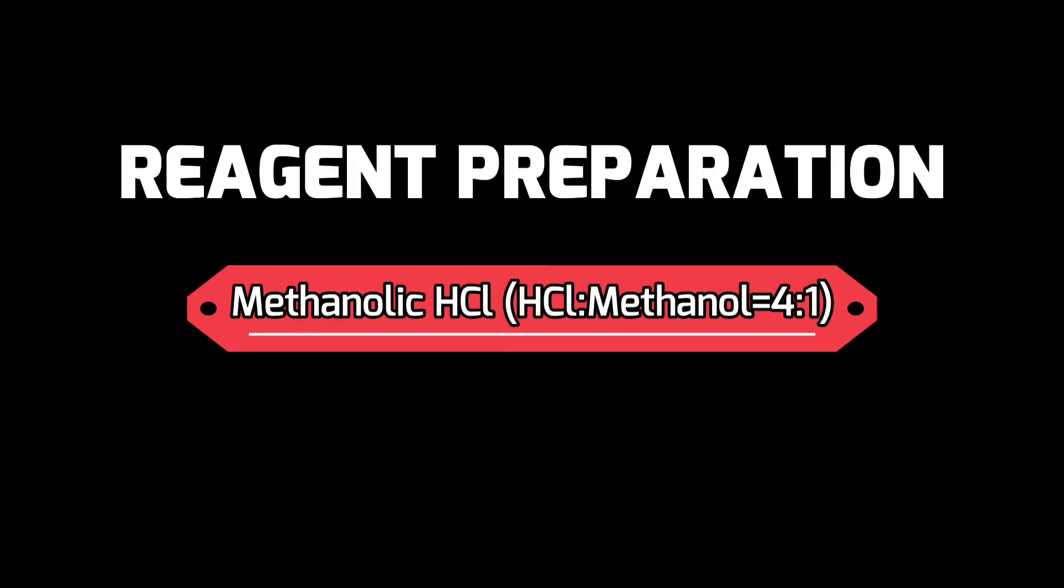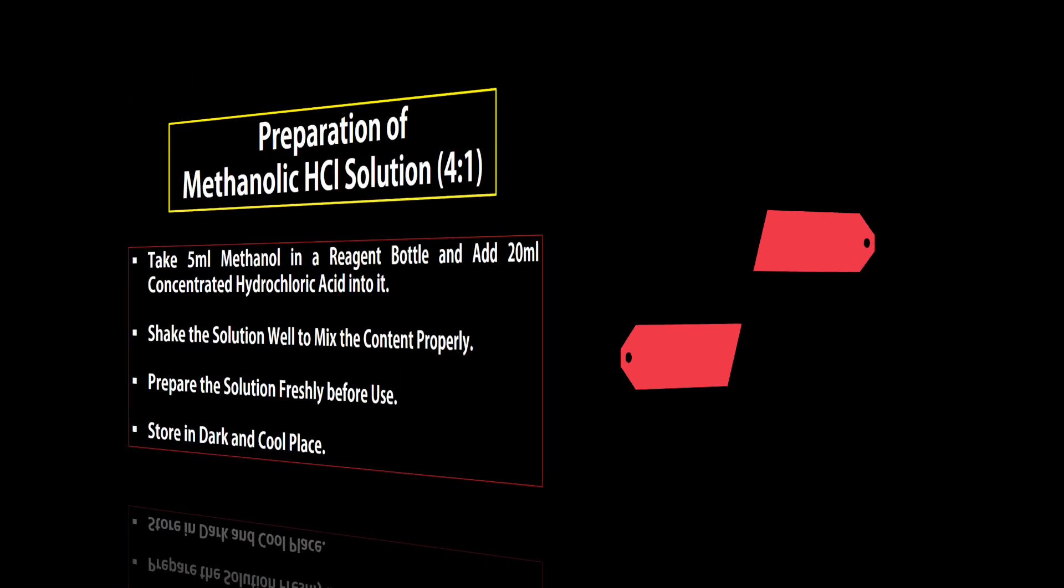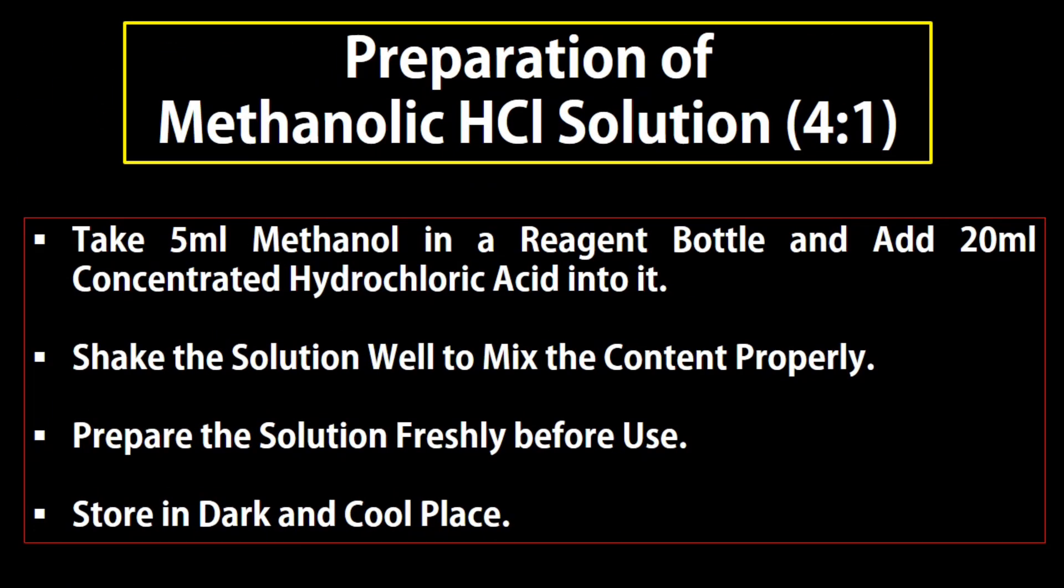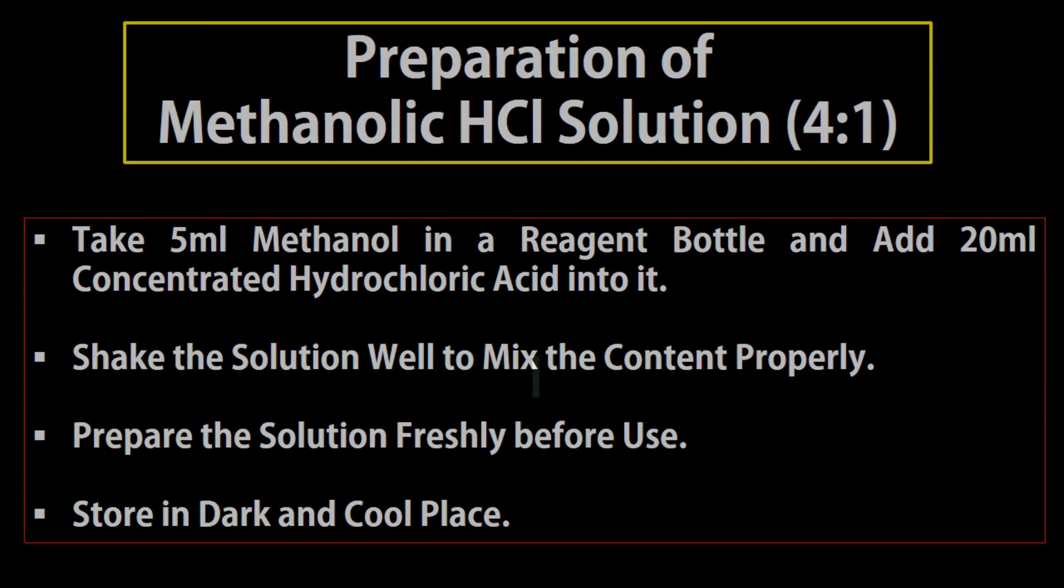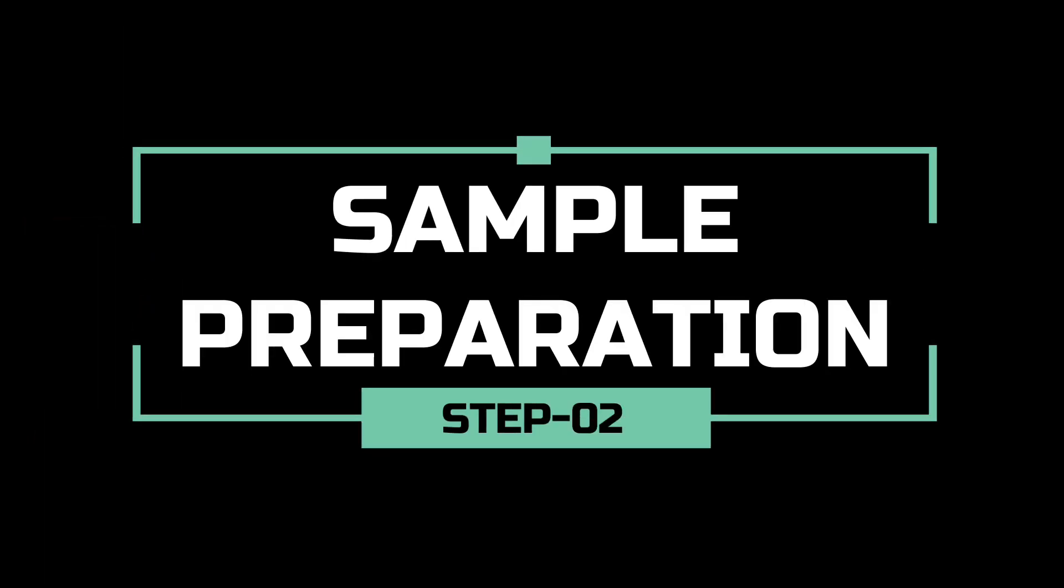We can prepare methanolic hydrochloric acid solution by mixing 20 ml hydrochloric acid with 5 ml methanol. Now we are ready for sample preparation.